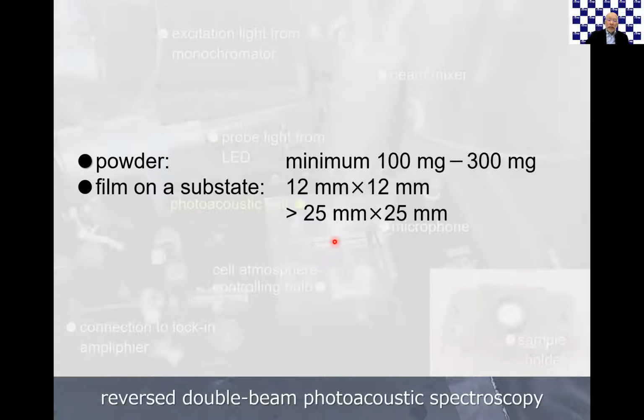Preferably a thick film, thicker than 500 nanometer, or preferably 1 micrometer thickness. That is very easy to detect. If it is thinner, we try to check, but actually the thicker, the better it is detected.